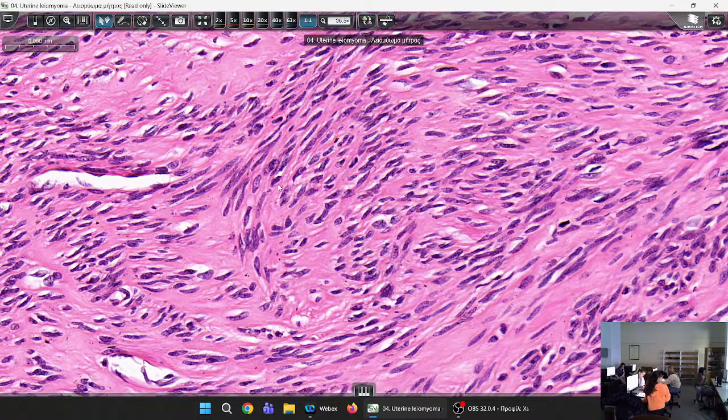The fibroblasts, yes, mesenchymal cells. Okay. Since this could be a fibroma, if those were fibroblasts, however, fibromas are not common in the uterus wall. The much more common and maybe the most common tumor is of benign nature and is composed of other types of cells with spindle morphology forming bundles. Which are they? Smooth muscle cells.